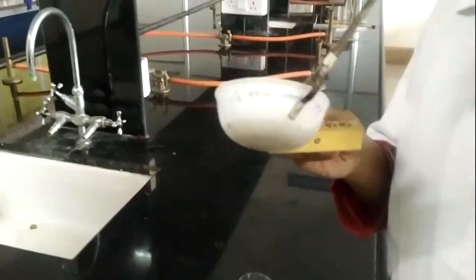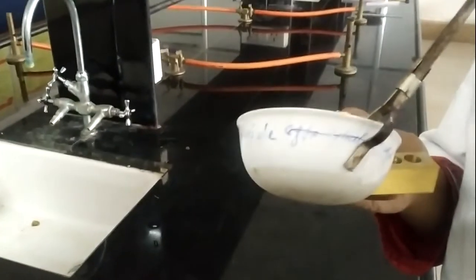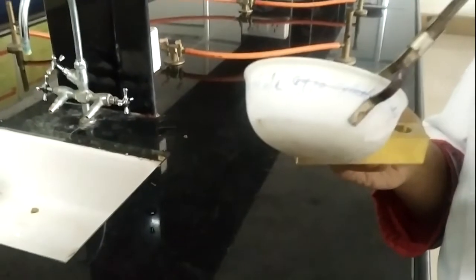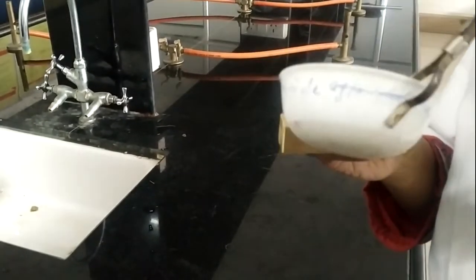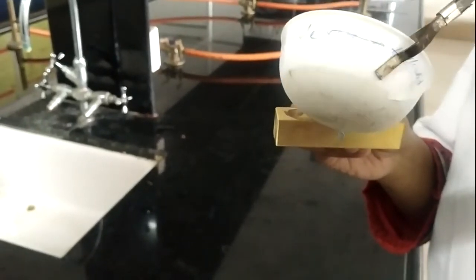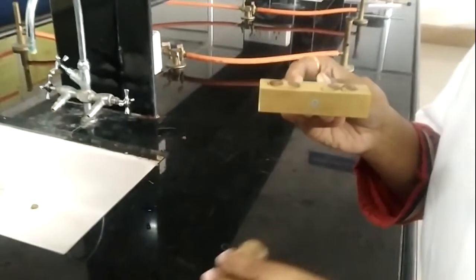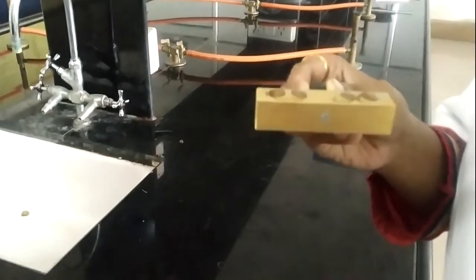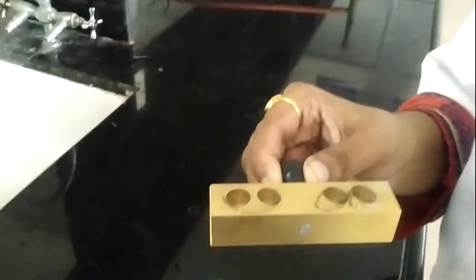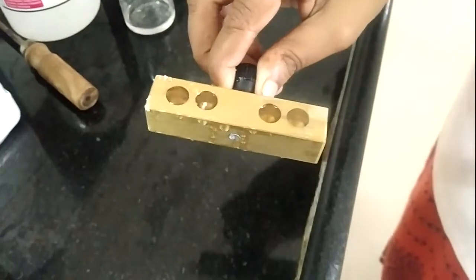I am going to fill all 4 cavities of this mold and overfill the mold. Let's see, I have overfilled this mold.